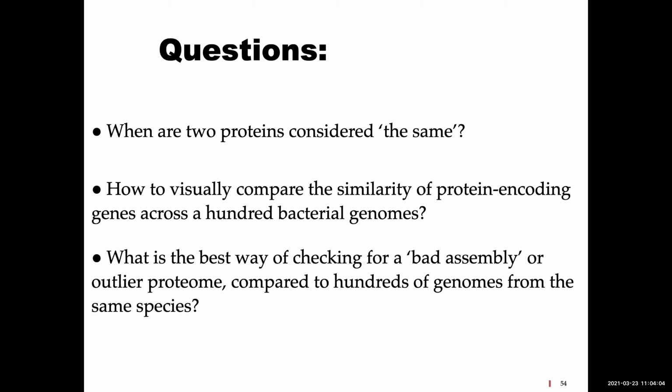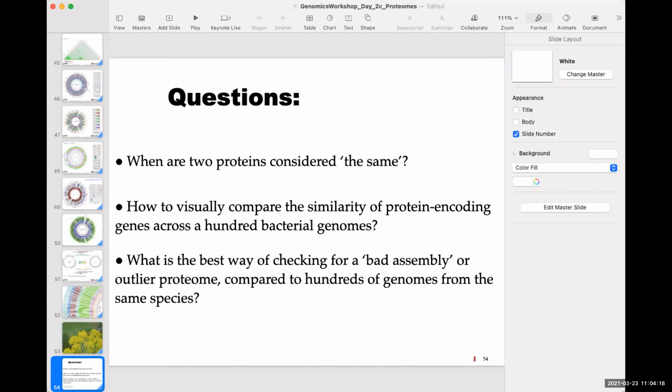And sometimes in a pan-core plot, you're going along and you add a genome that's bad, and the core drops and the pan jumps. Then you know there's something screwy going on there. So that's the end of that.